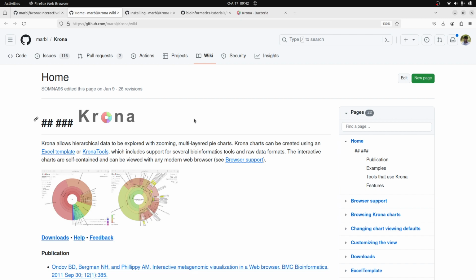For this tutorial, we are going to compile from source. There are other ways to install, such as using Conda, which we will talk about later on. But for now, it's just the classical installation procedure. That's what we are going to do here.